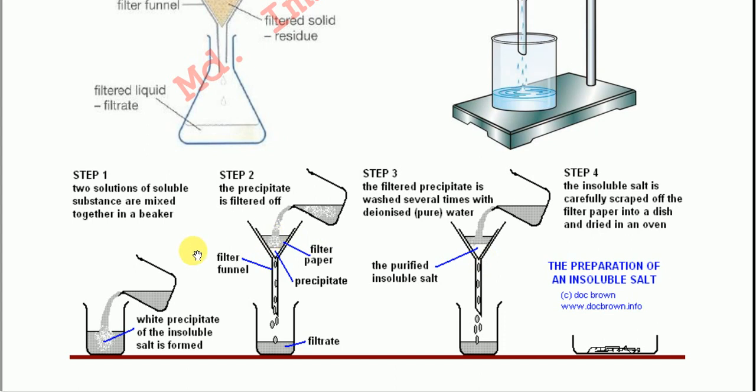This is the white insoluble salt. This is another symbolic step. You have to take the hot sodium carbonate solution in a beaker. You have to take a hot solution of potassium alum in another beaker. You have to put this potassium alum solution into this sodium carbonate solution, and this will produce the gel. This white thing is producing the gel. This is the white turbidity.